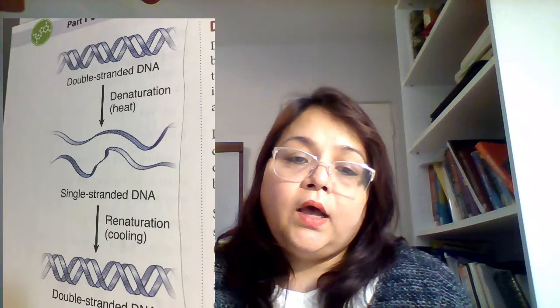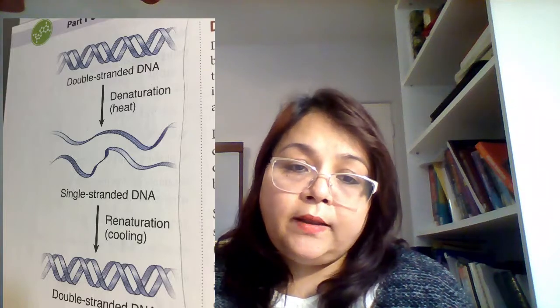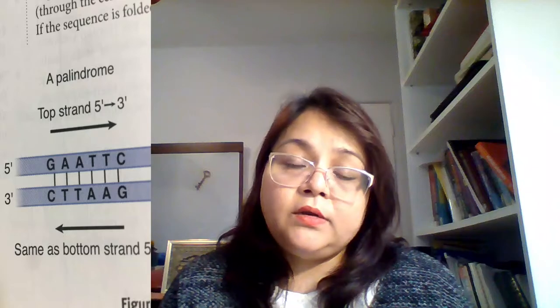The heat actually causes the disintegration or separation of the two strands of the complementary DNA, thereby exposing the target base sequence, so that this target base sequence can attach to the primer, which is the predetermined base sequence.